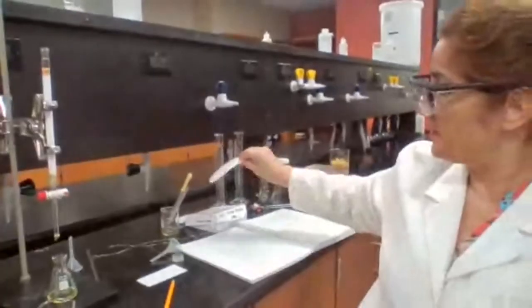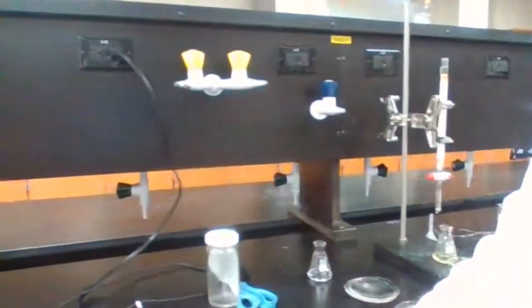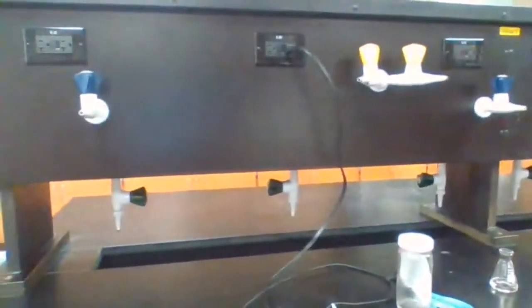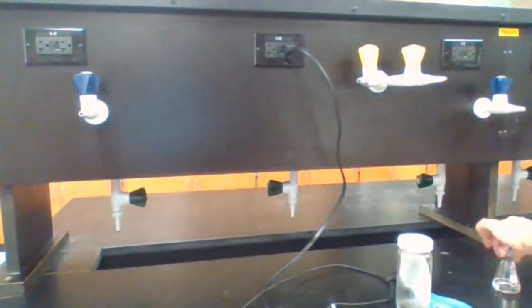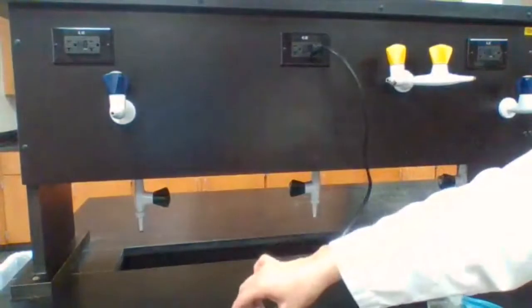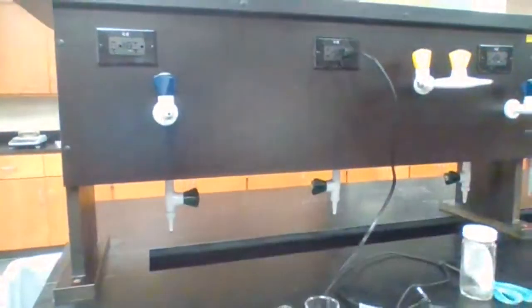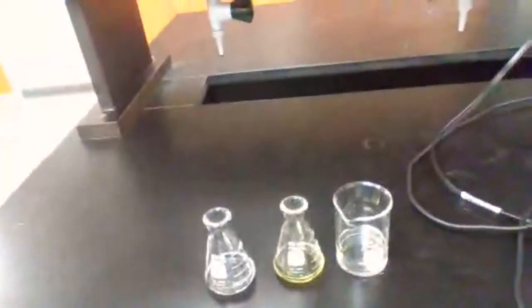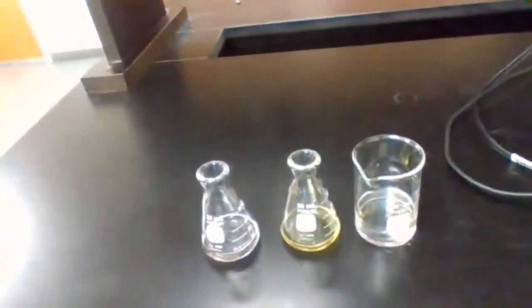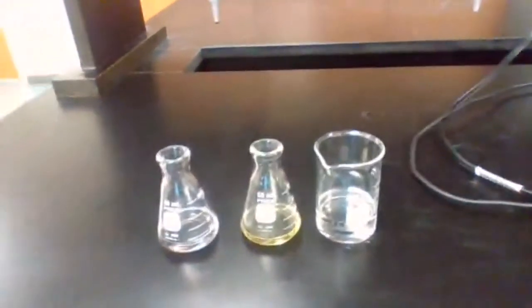Next step is to take a screenshot, take a clear picture, try to make it as clear as possible for yourself. A screenshot of the fraction 1, fraction 2, and the waste container. Okay, take a screenshot.